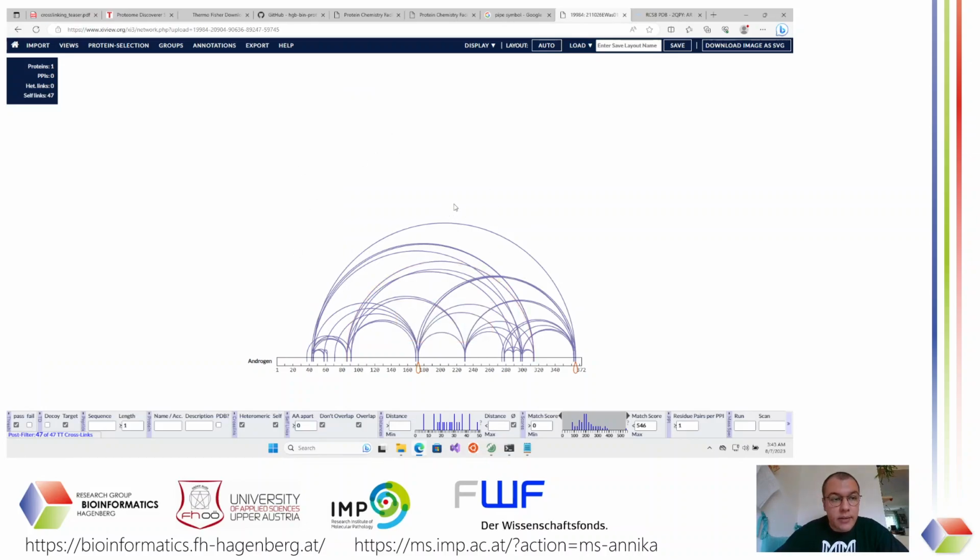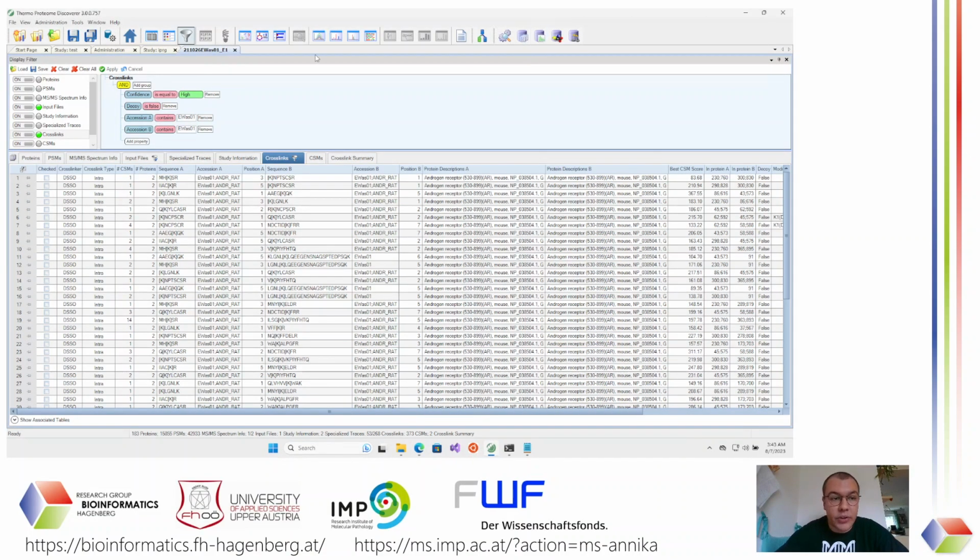That's basically it for some basic introduction to MS Annika. To cover more advanced topics, I would now go over to the case of what happens if your crosslinker is not already defined in Proteome Discoverer.